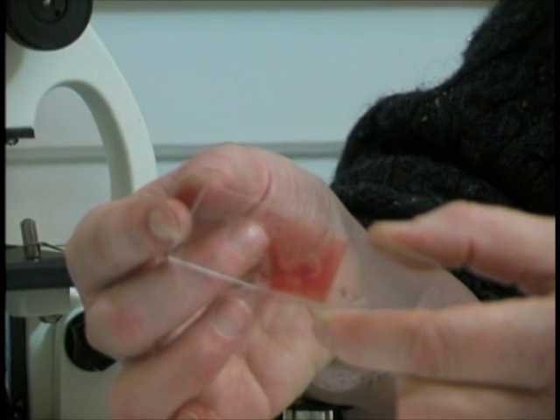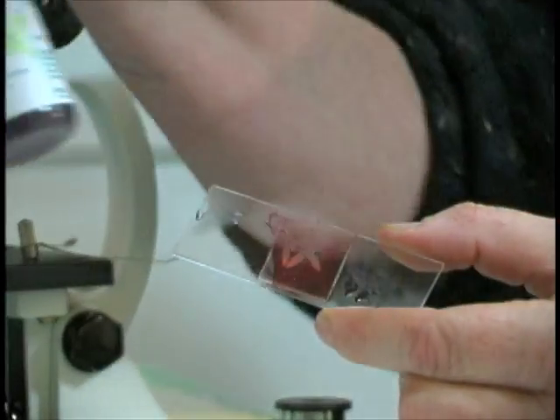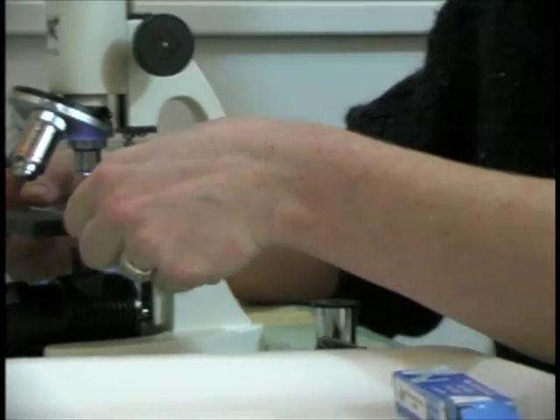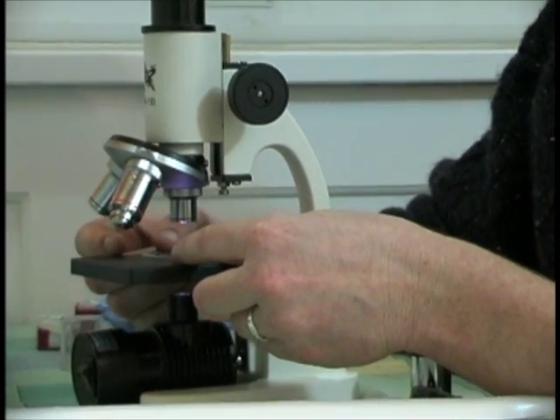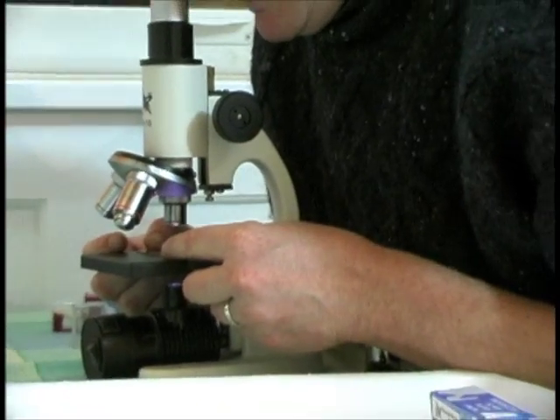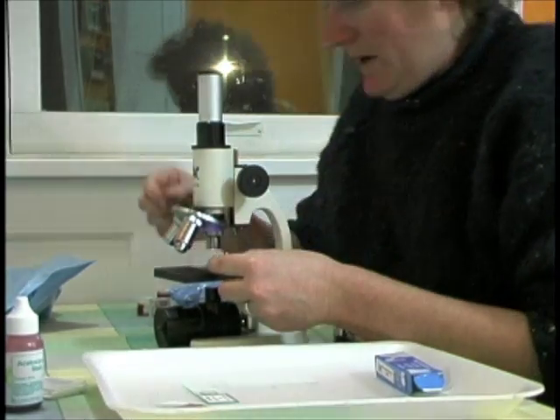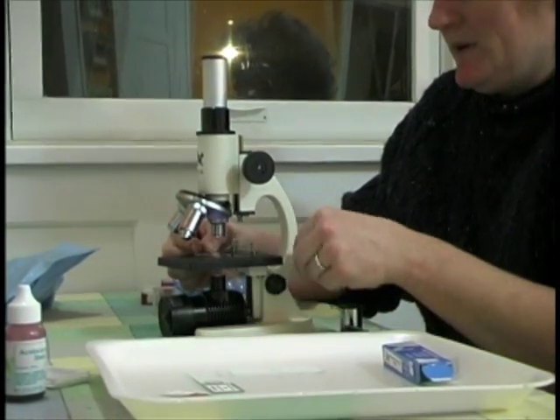Here's the slide I prepared of onion root tips stained with the Acidocarmin stain. I'm going to put my prepared slide under my microscope under the lowest power — that will help me find where the root tips are. I found the root tip. Now that I know exactly where I want to look, I'm going to put the stage clips on very carefully.